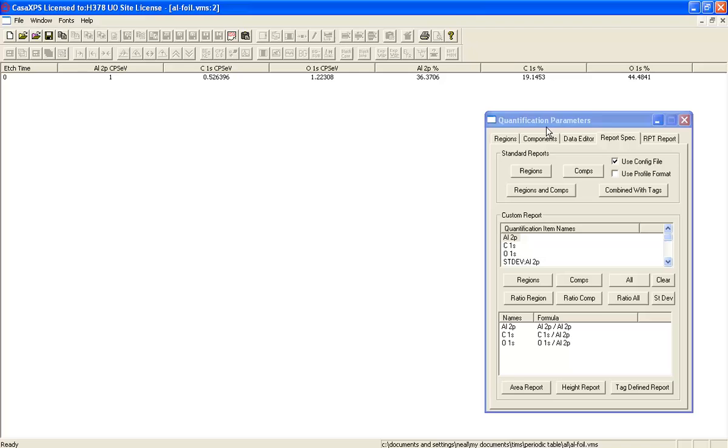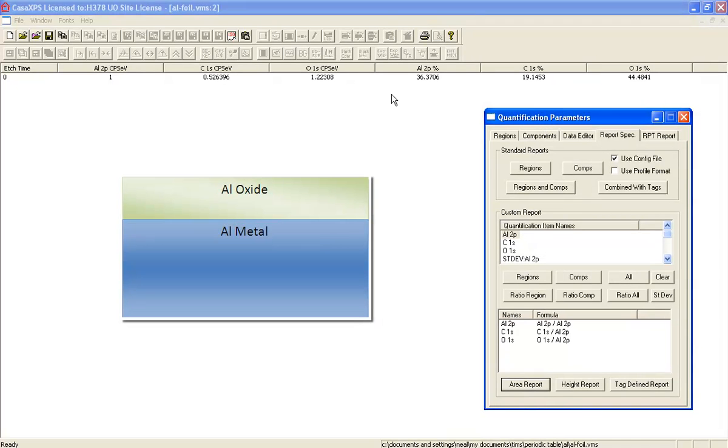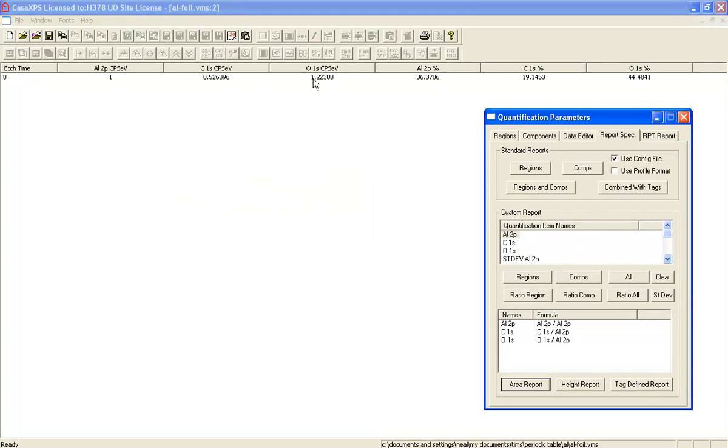I press the area report, and you can now see that the ratio of oxygen to aluminum is 1.22.